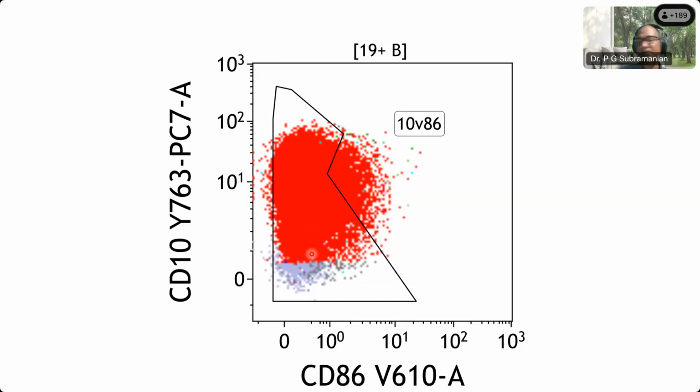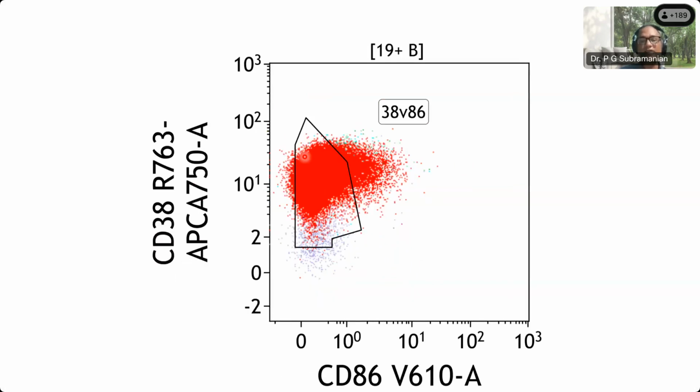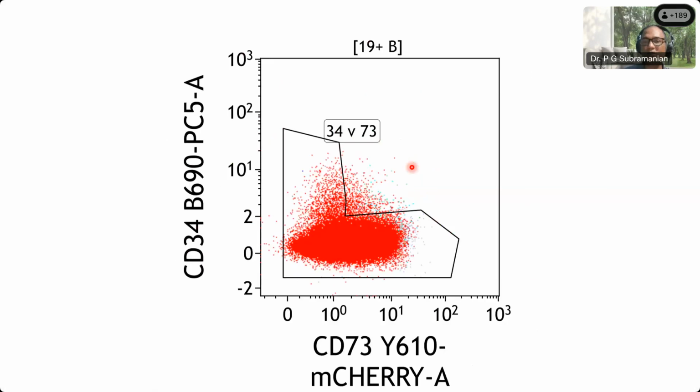So CD10 is variable. CD86 is again slightly going out. Normally this is marked where the normal CD10 and CD86 pattern should fall. As you can see, a part of CD86 is overexpressed, but otherwise it is very difficult, and small portions you generally wouldn't pick up. This is a little different from immunohistochemistry in the sense that this is also quantitative. Immunohistochemistry is semi-quantitative at best; it cannot be quantitative. So this also gives us precise quantification of the antigen.